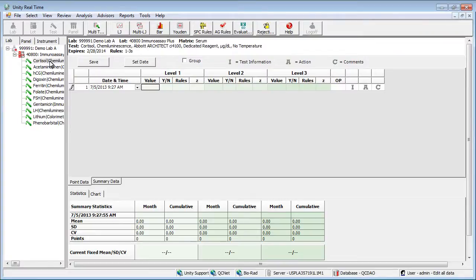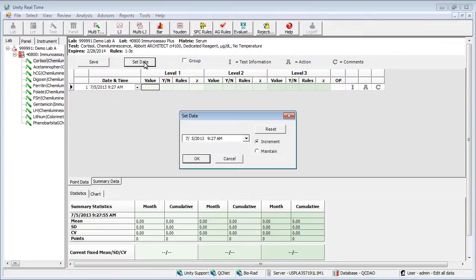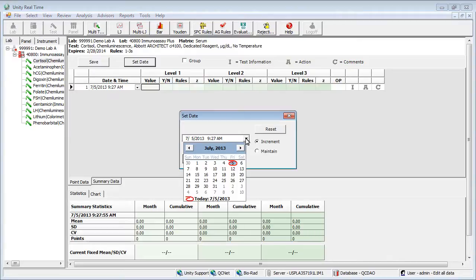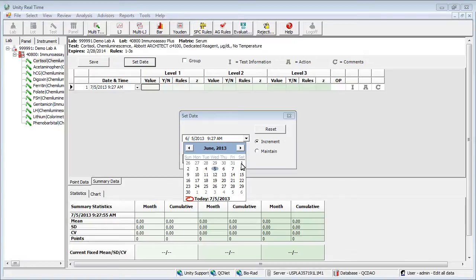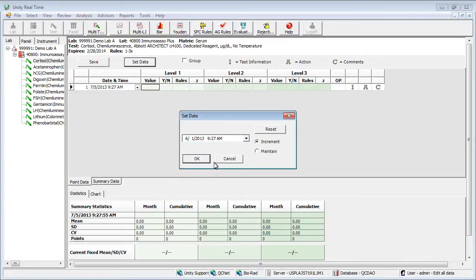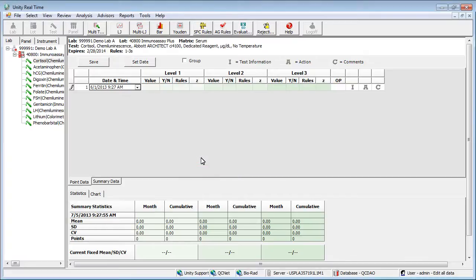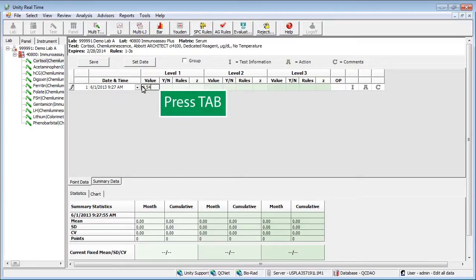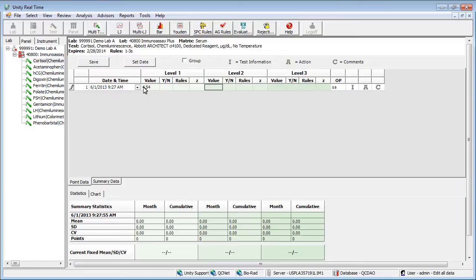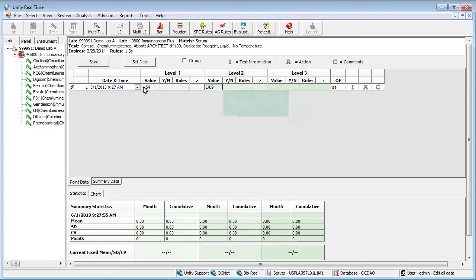To enter data you'll need your date. We'll use the set date button. The drop-down calendar allows you to choose a date. Click OK. Enter your first value. Press tab to move to the next field. Continue to enter the remaining data, pressing tab to move to the next field.